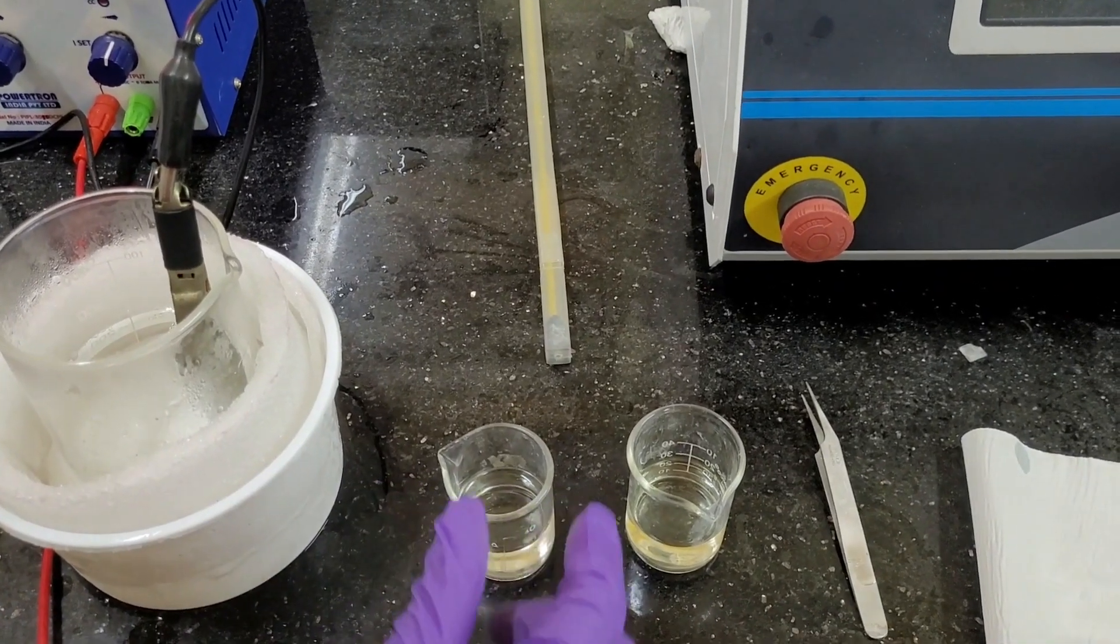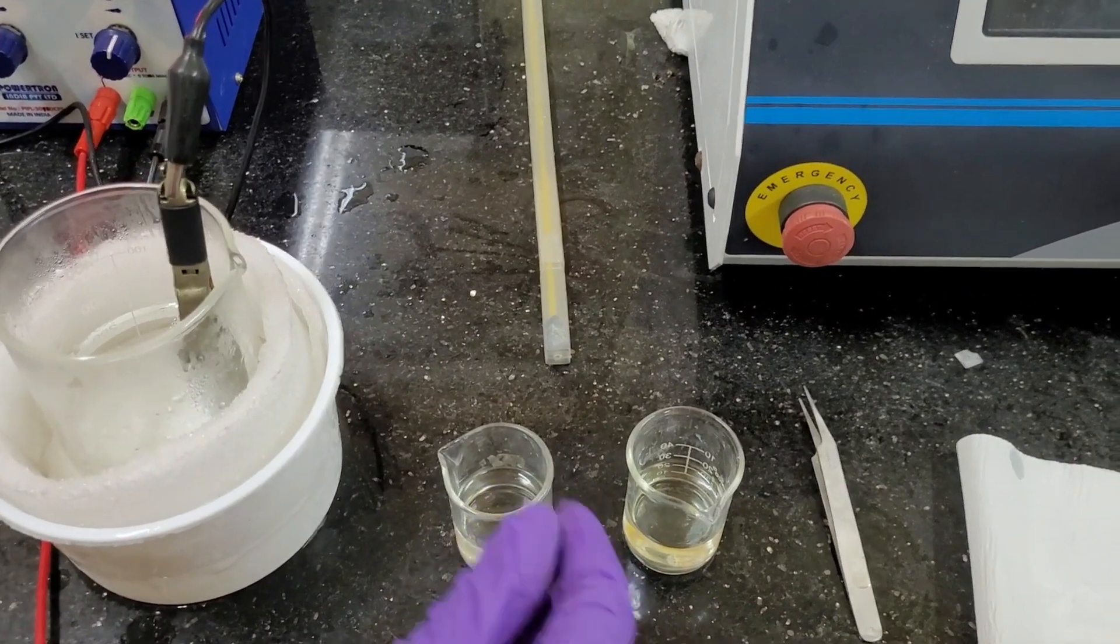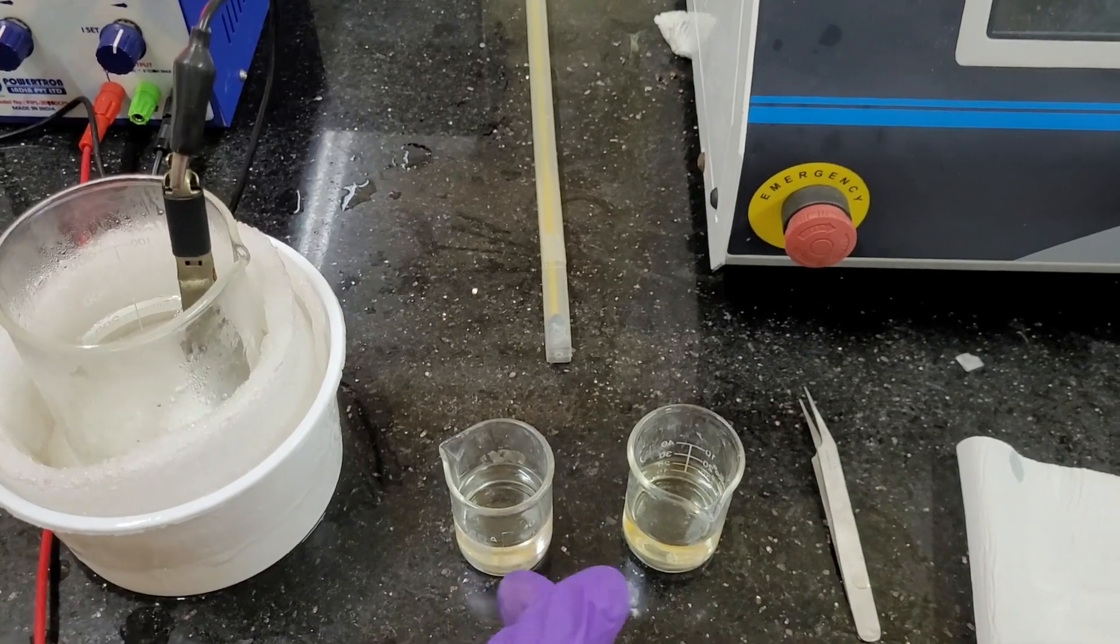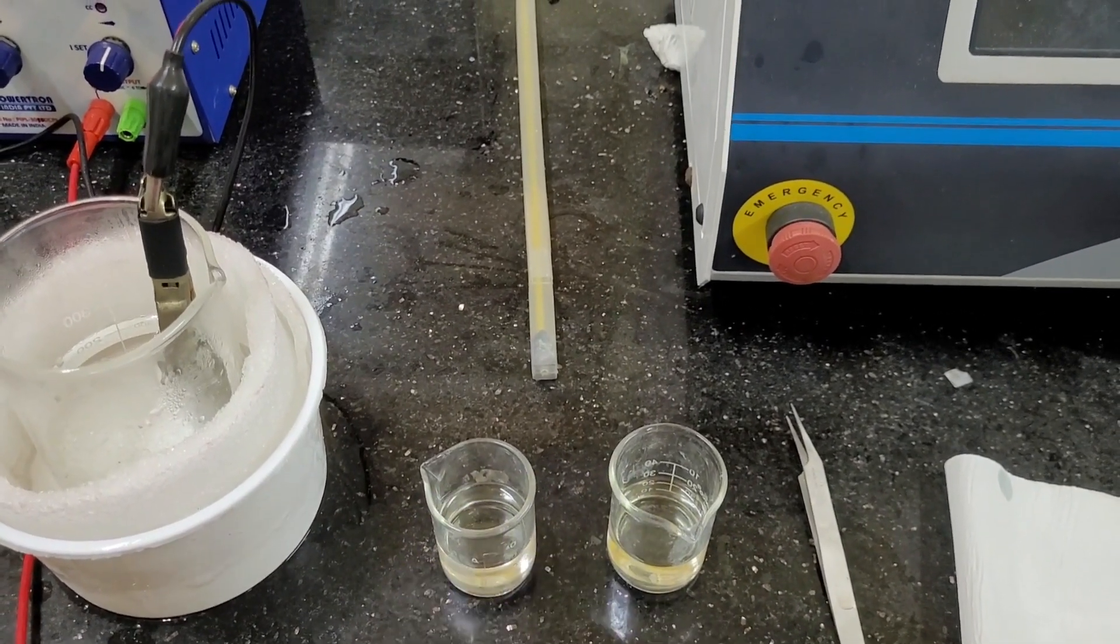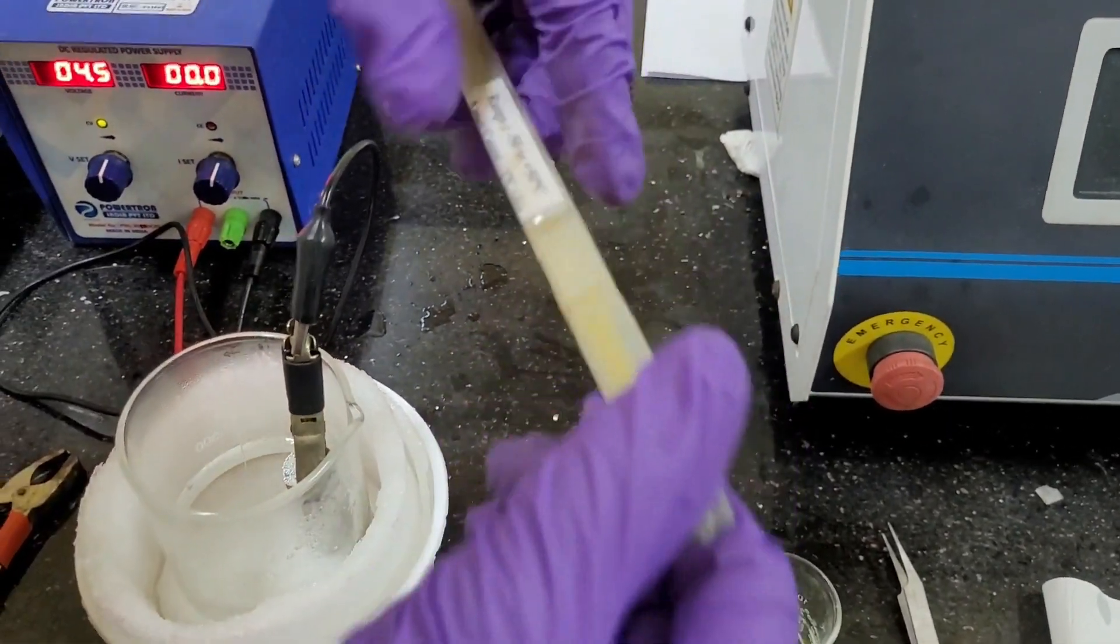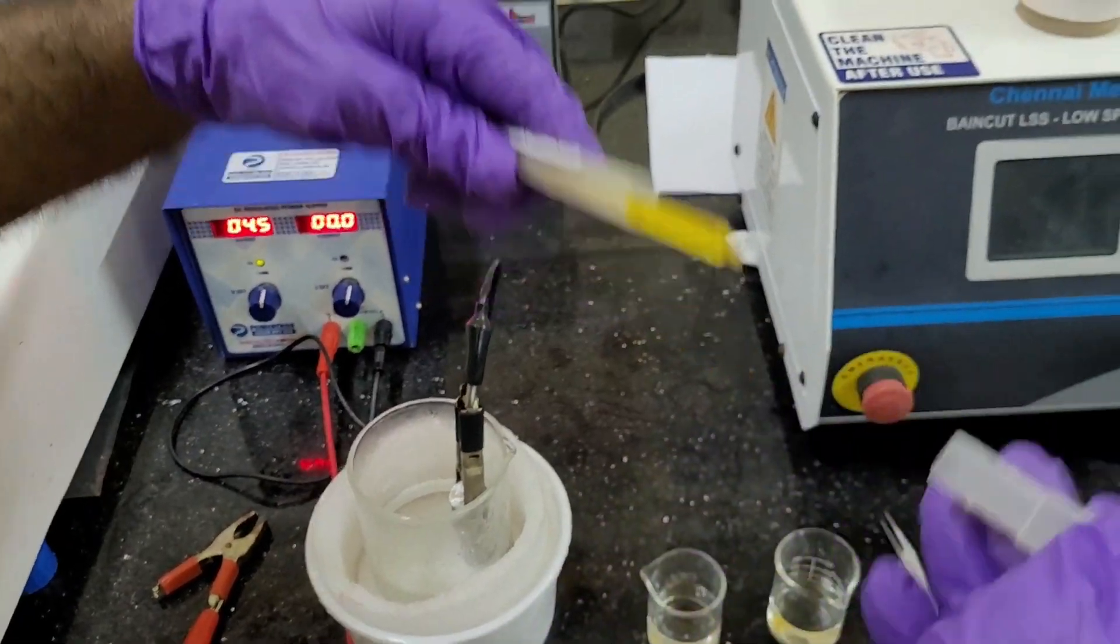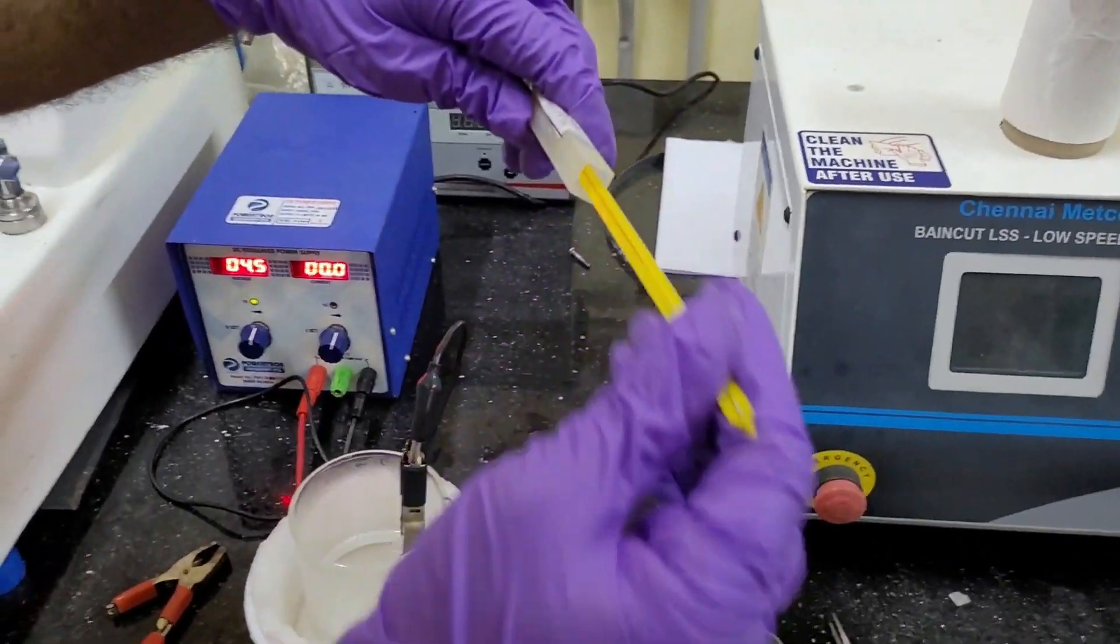This is the two beakers in which we have put any kind of cleaning solution. For example, we have taken the ethanol in these two different small beakers. And apart from all these, we also have a specific temperature measurement instrument.